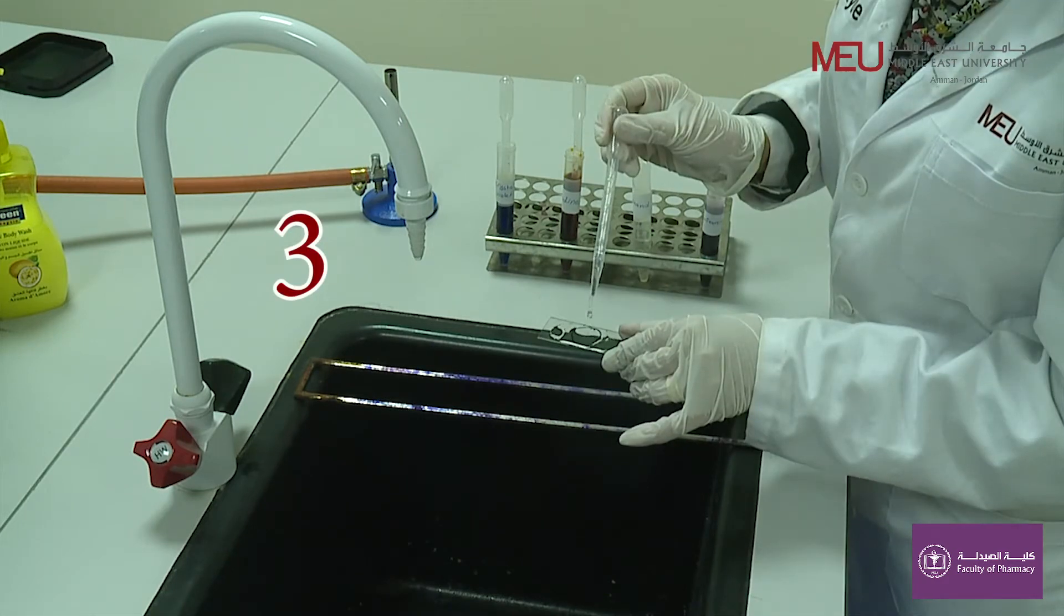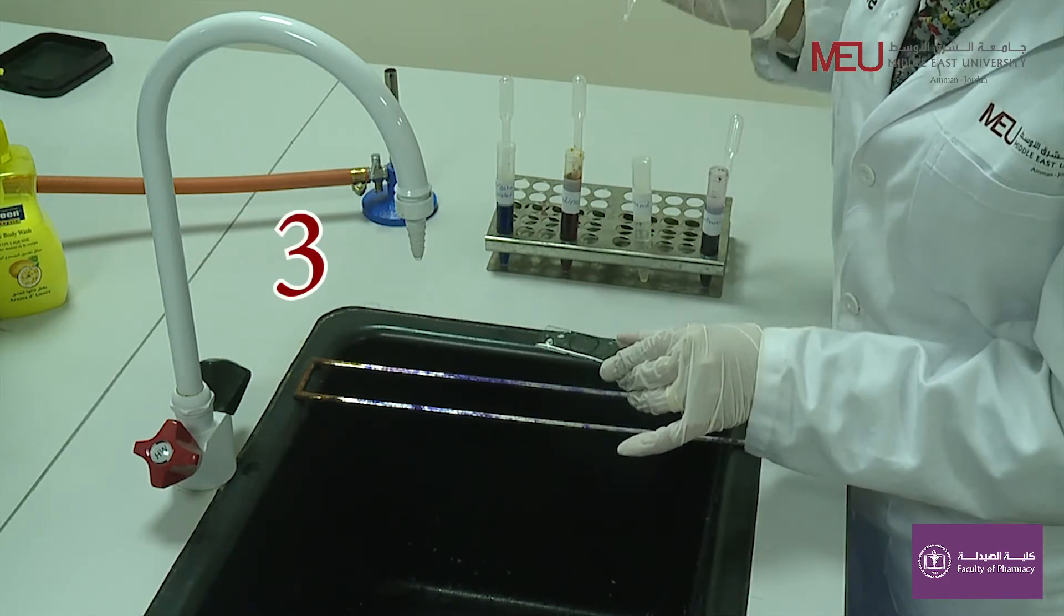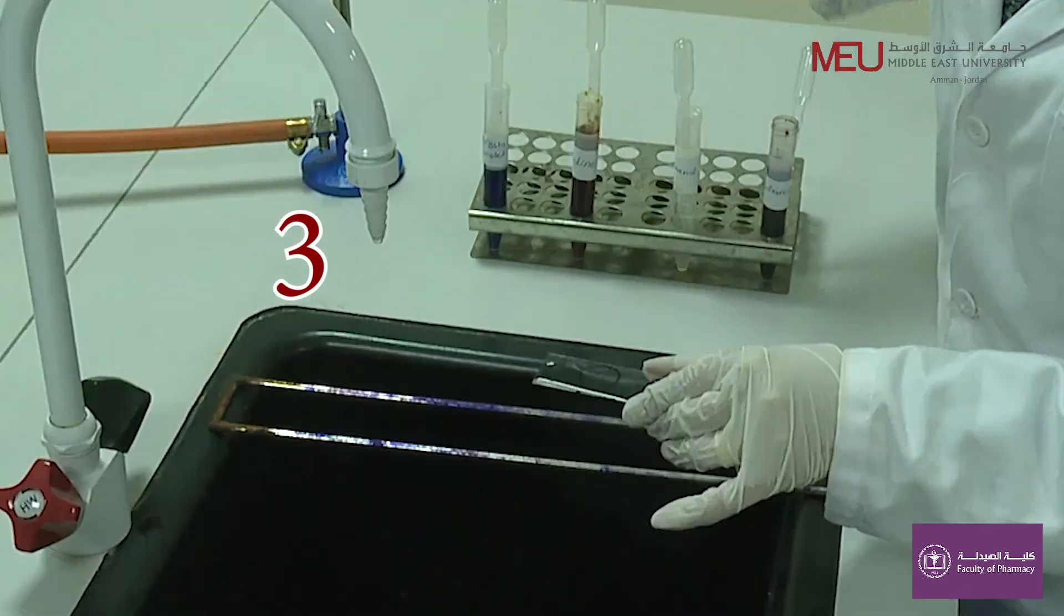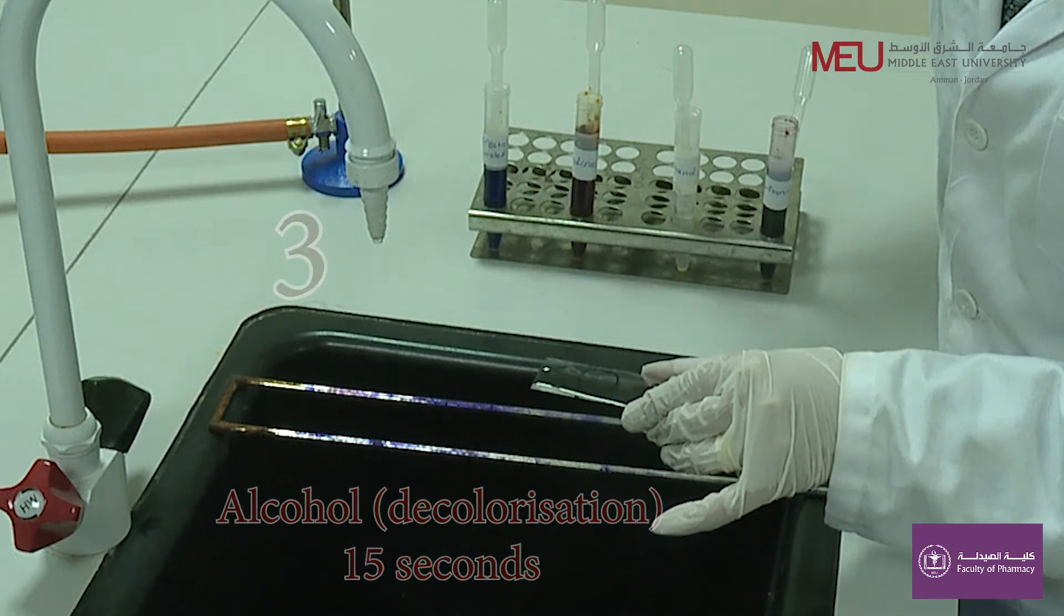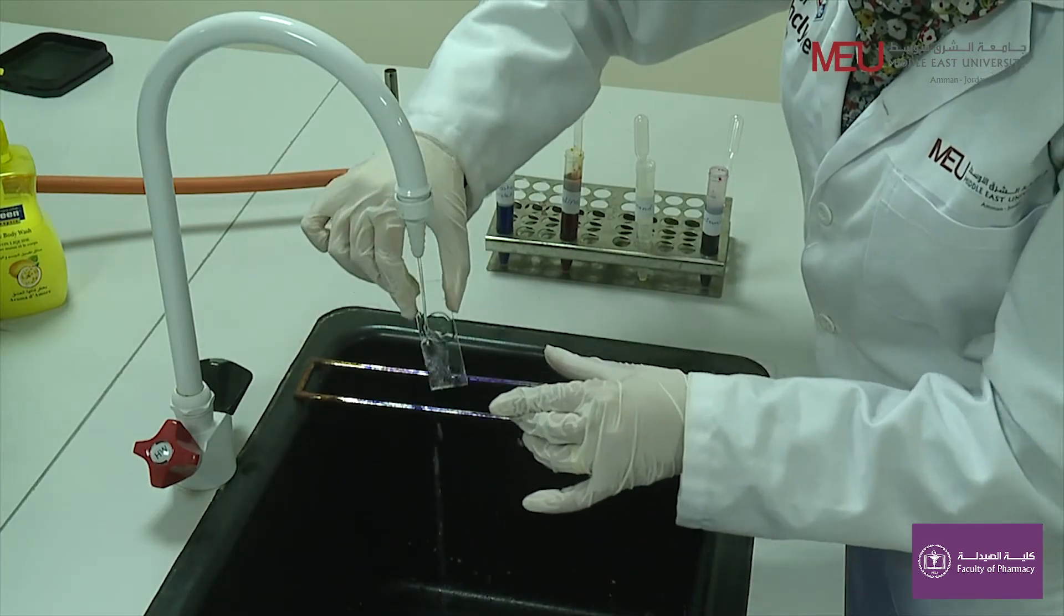Step number three includes rinsing with decolorizing reagent as demonstrated by the instructor. This is a crucial step and should take only 15 seconds. Immediately rinse the smear with water to remove the last bit of the crystal violet and decolorizing agent.